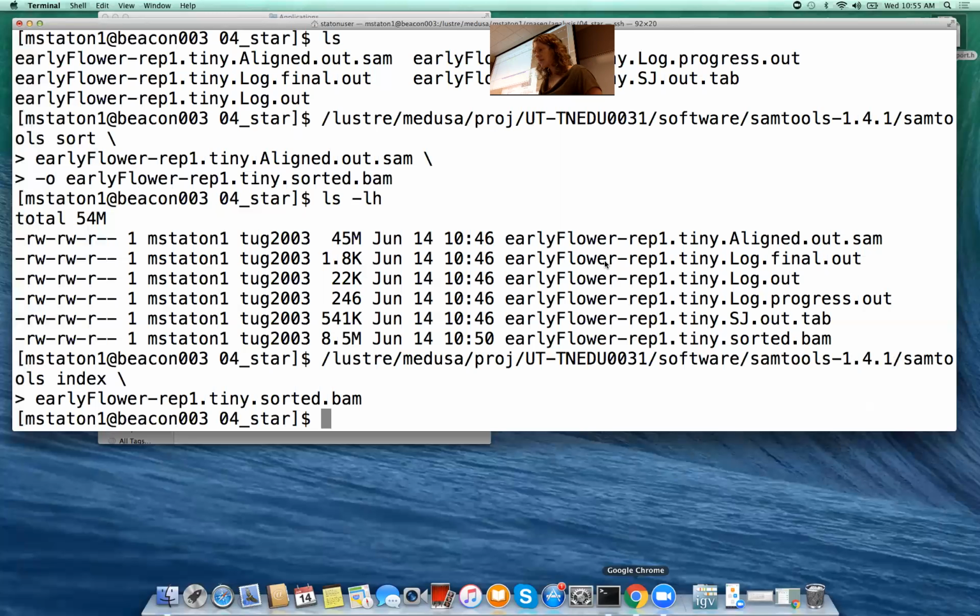Just a second. What's the next file after the GFF file? The BAM file? Okay. Oh, I'm getting an exclamation point. I don't know why. This worked earlier. Is anyone else actually seeing reads?